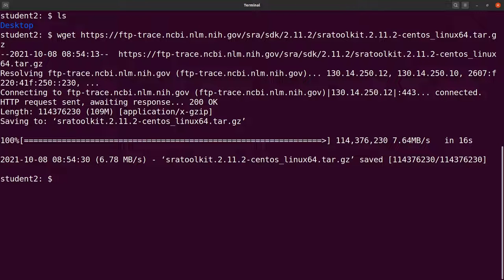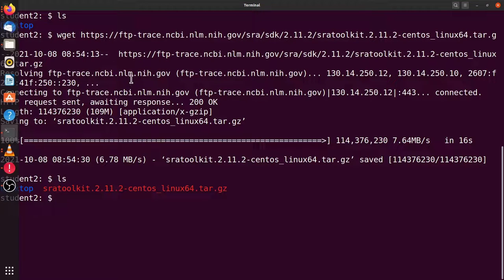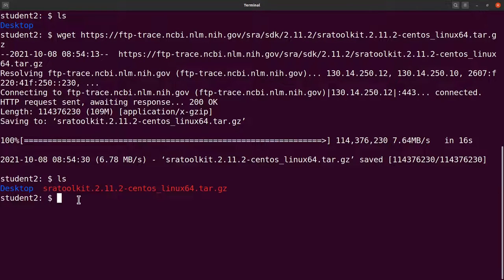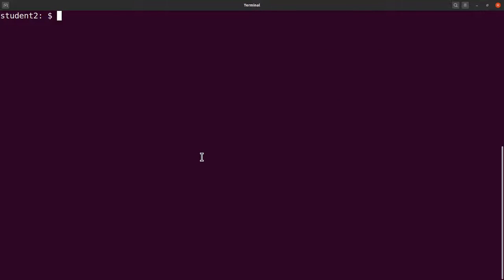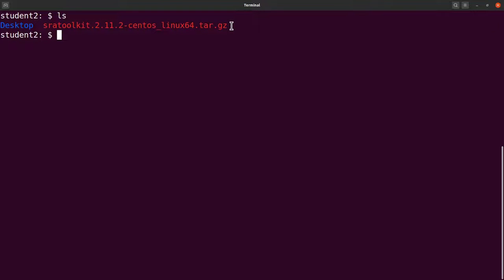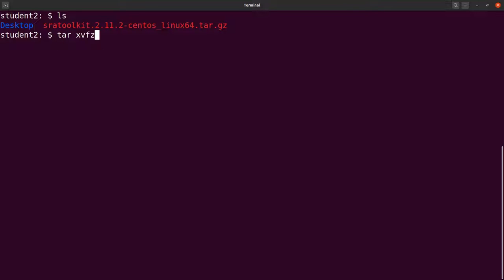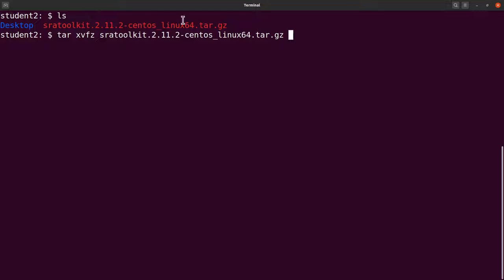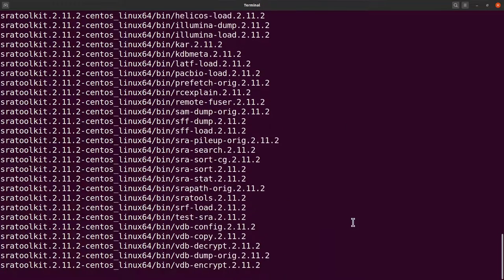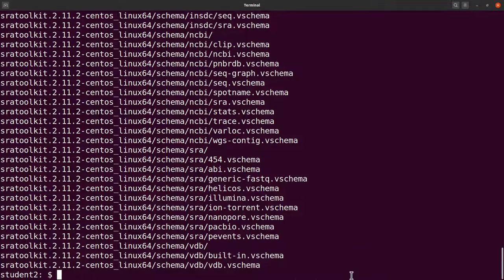The download is complete. Let's do an ls again and you can see the file is there. This is a tar file — it's compressed — so we need to extract the contents to access the SRA Toolkit binaries. We use the tar command with the flags to extract and see what is happening, then supply the file name to extract the content. Let's wait for it to complete.